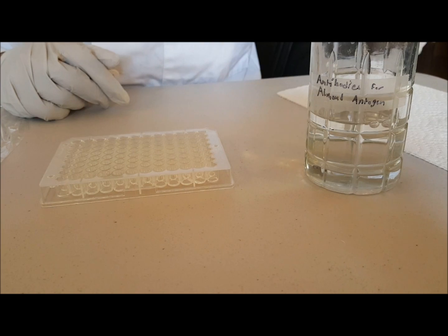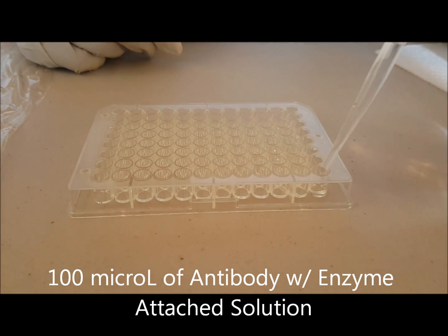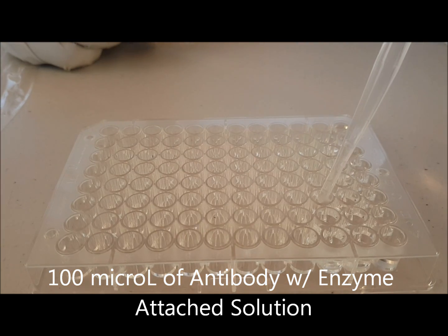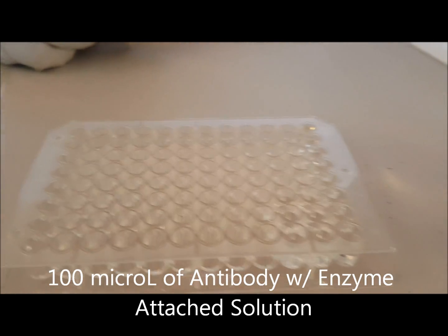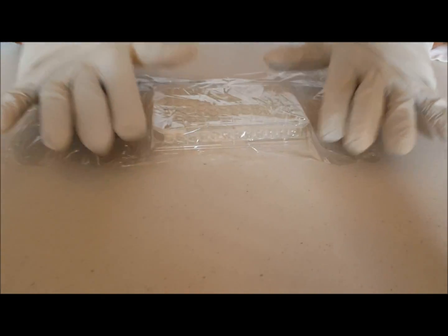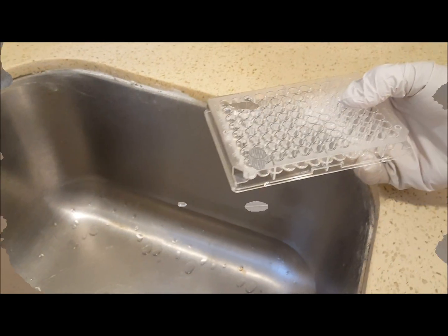For the next step, 100 microliters of solution containing the antibodies of that target antigen of interest is added in. The antibodies have enzymes attached to them, which we'll go ahead and discuss a little later. It's allowed to incubate again for one hour at room temperature. The excess is removed and washed with the same buffer solution.